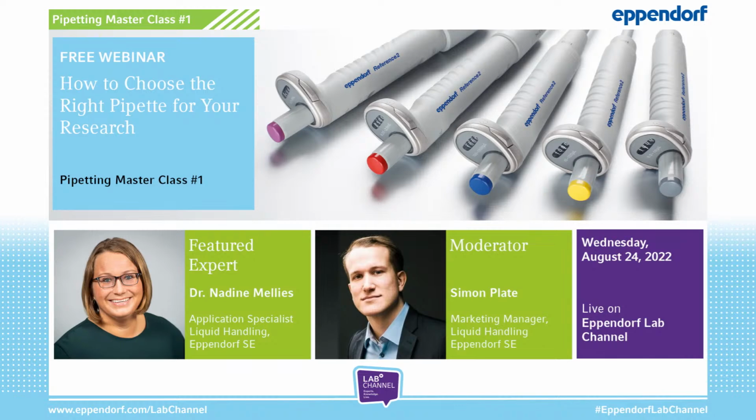In the next 30 to 40 minutes, you'll learn the basics of different liquid handling tool operating principles, key pipetting terminology and concepts like single and multi-channel pipettes, and which factors to consider to find the perfect pipette or dispenser for your lab.